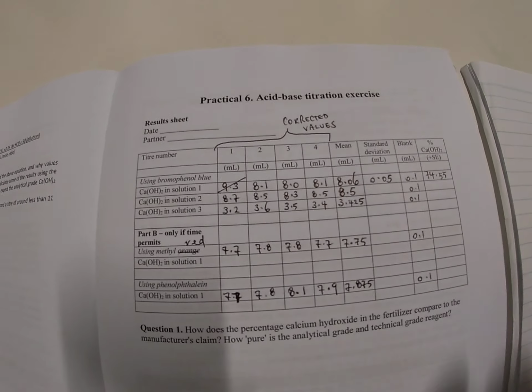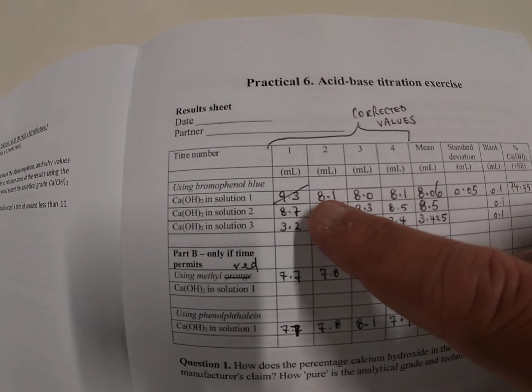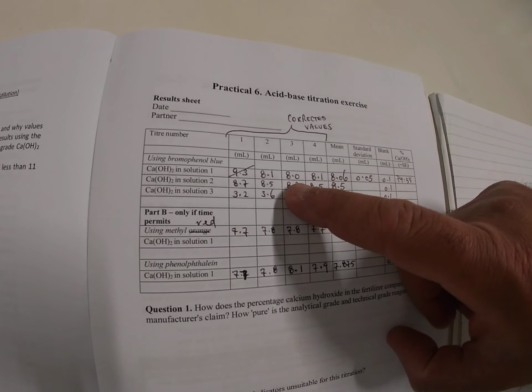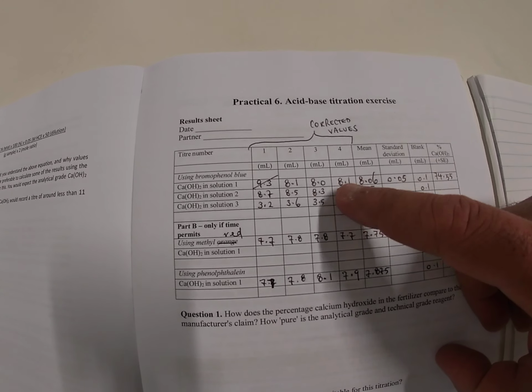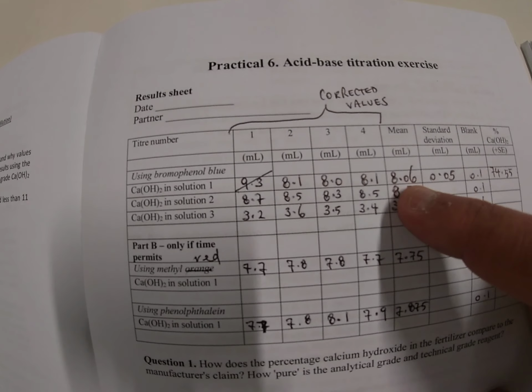What I've now done is prepared the mean, and the mean is all these numbers added together divided by the total number. In this case, it will be 8.1 plus 8.0 plus 8.1, all added together and then divided by 3, and that will give us a mean value of 8.06.